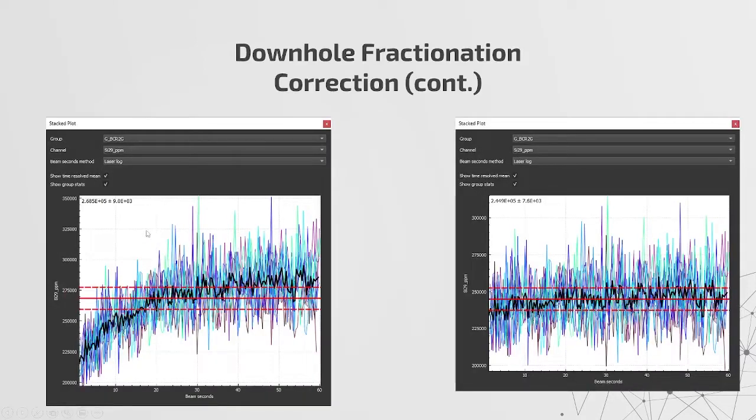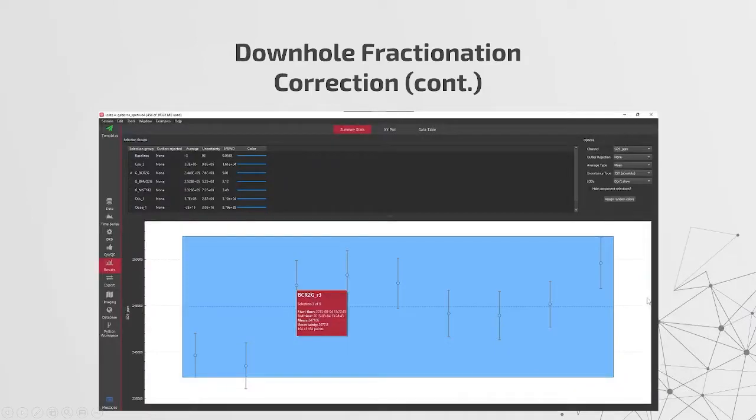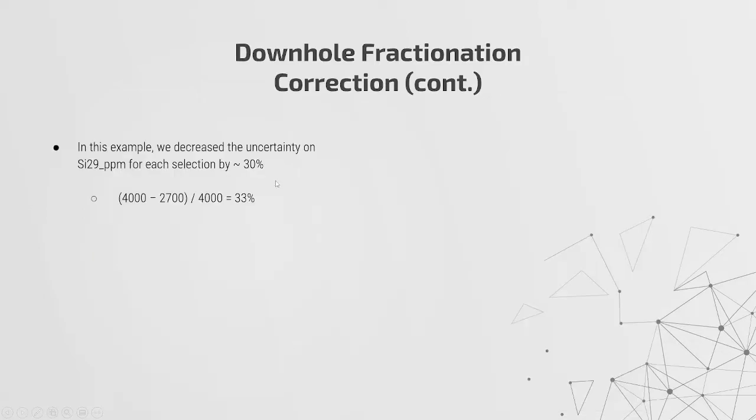When I ran this the first time, I got a slightly different result, but you can see that you can correct these all the way down to being even more flat. When we get that correction even further, it goes below 3,000, and so we can get an improvement on our uncertainty of up to about 30% compared to our original uncertainty.